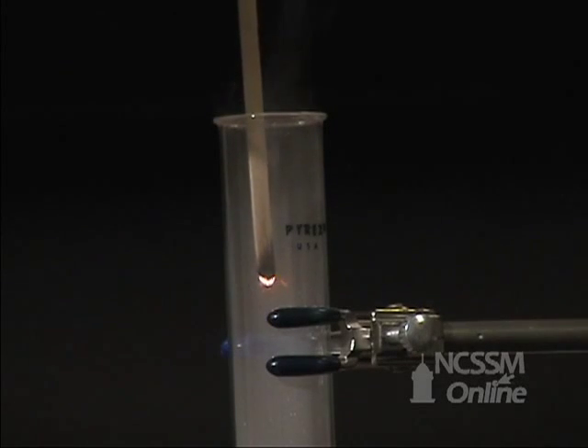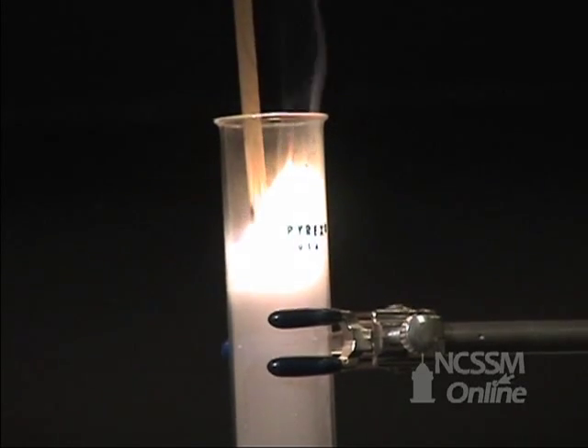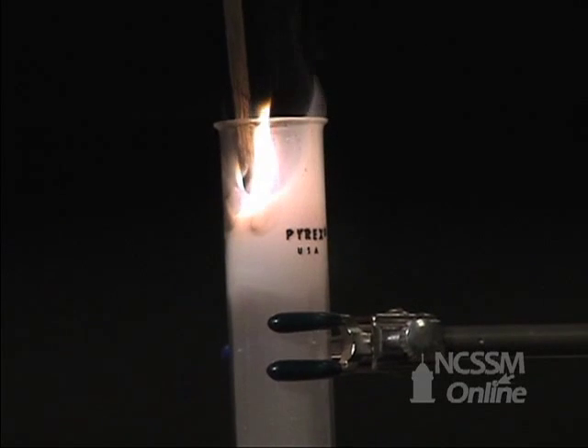If we bring in a glowing splint, the glowing splint will burst into flames due to the increased rate of combustion due to the presence of the oxygen.